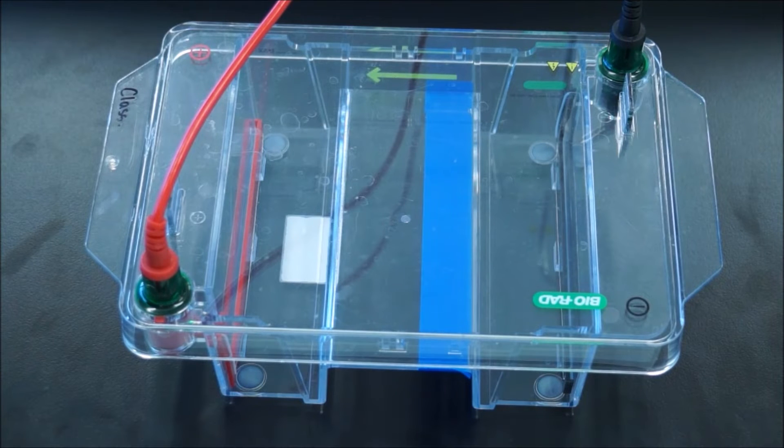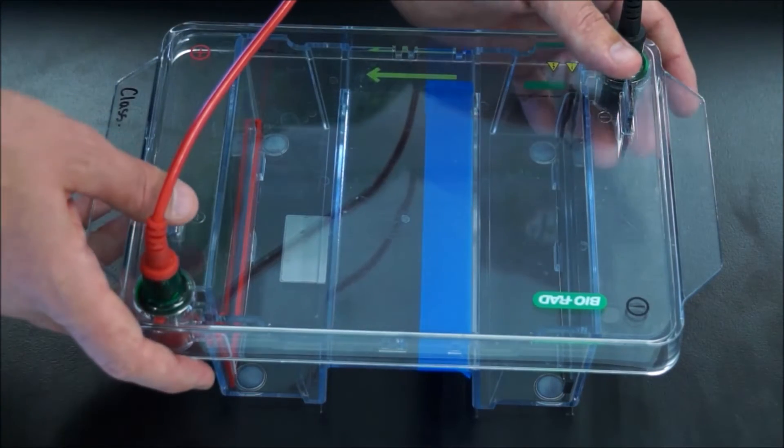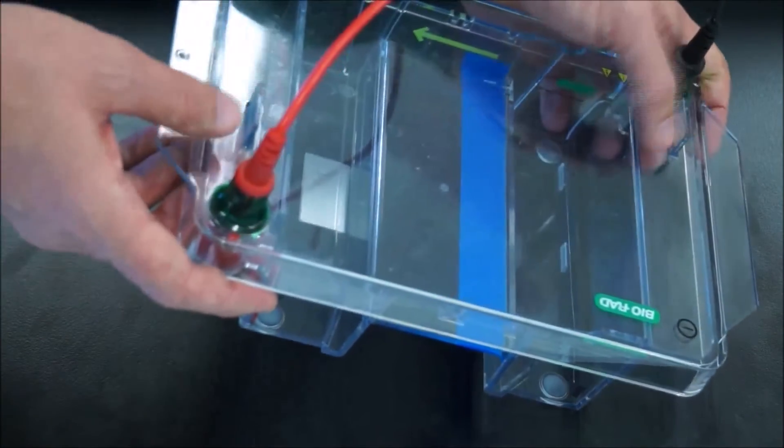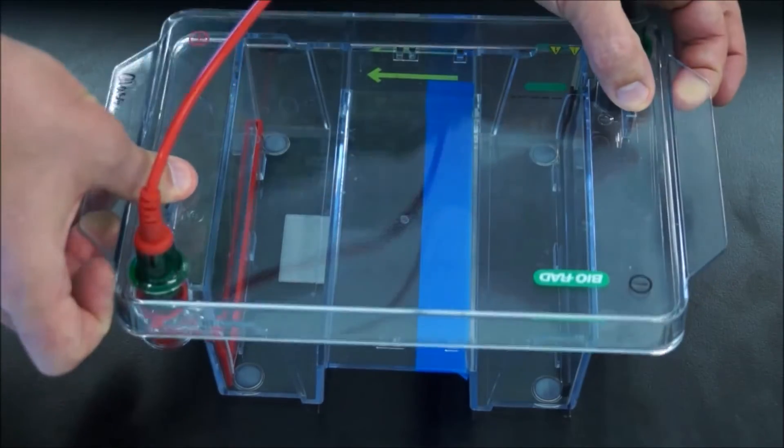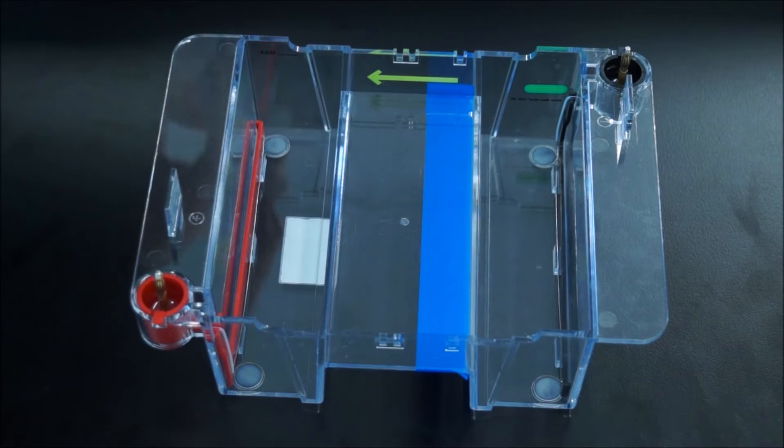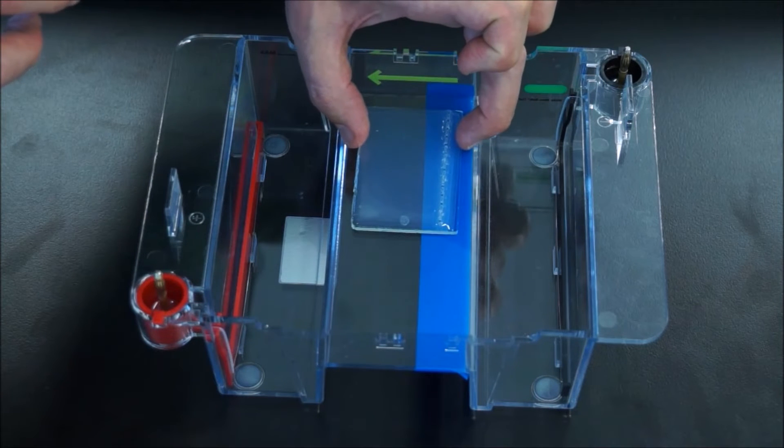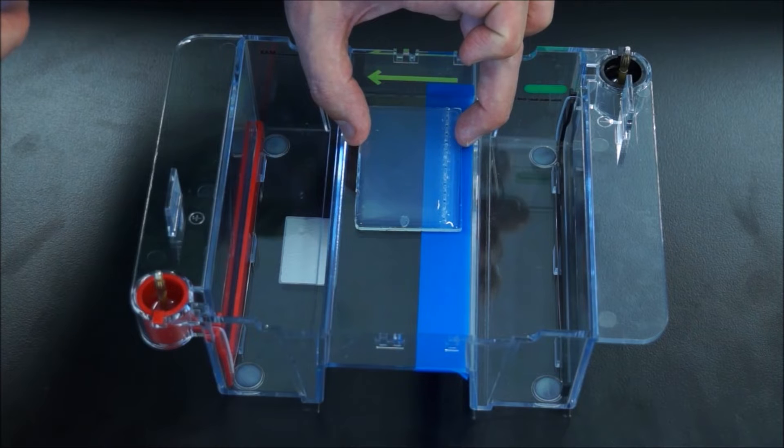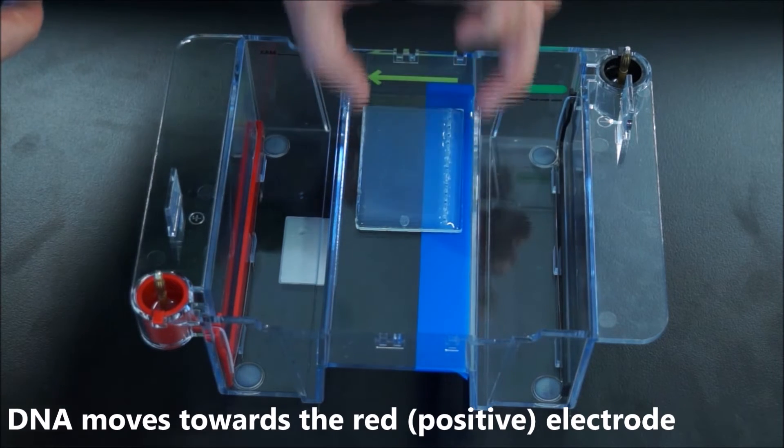Next thing to do is to set up your gel tank. Just pull the lid off. Most of them have little buttons on either side - just put your thumb on that and pull up with your fingers. Now you need to put your gel in so the wells are situated above the tape. This makes it easier to load and also gives you an indication of which way the DNA is going to move.